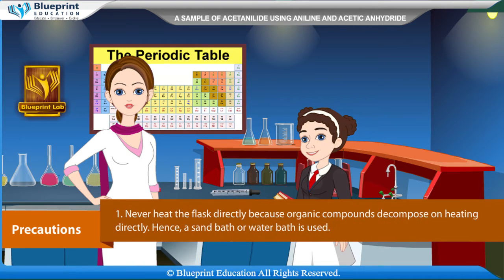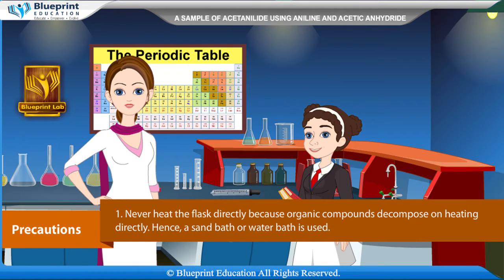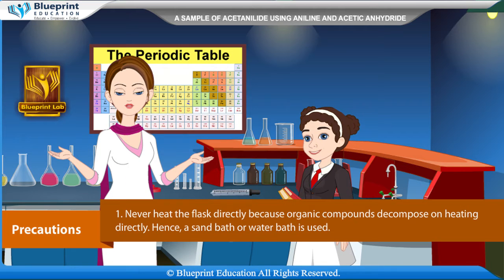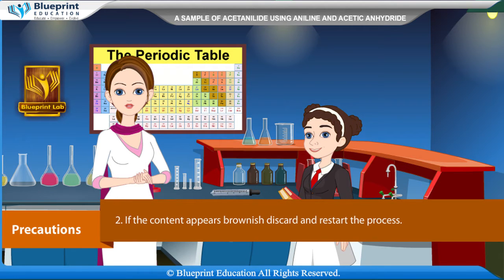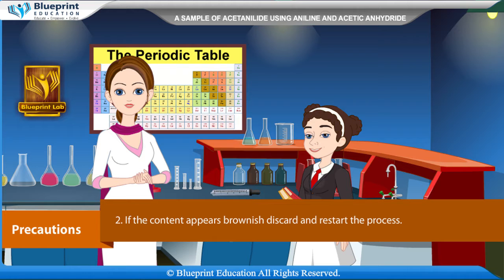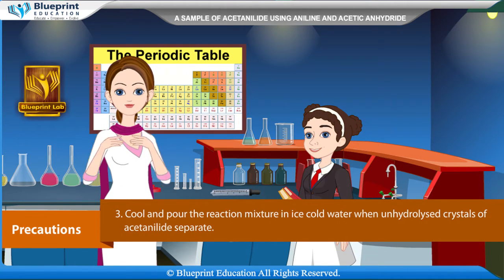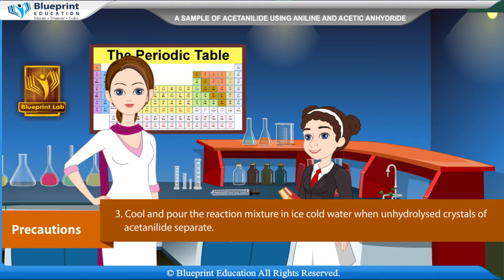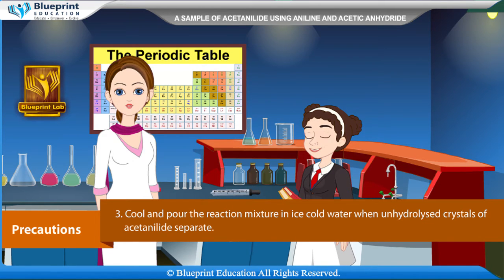Precautions: Never heat the flask directly because organic compounds decompose on direct heating. Hence, a sand bath or water bath is used. If the content appears brownish, discard and restart the process. Cool and pour the reaction mixture in ice cold water. when unhydrolysed crystals of acetanilide separate.